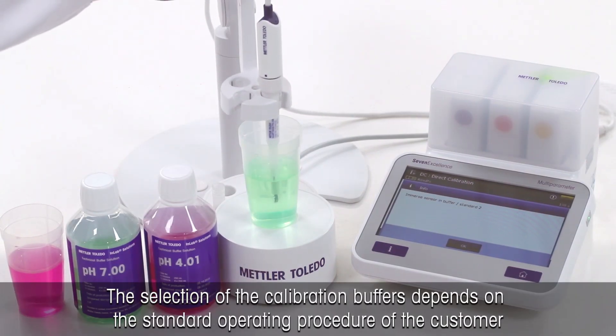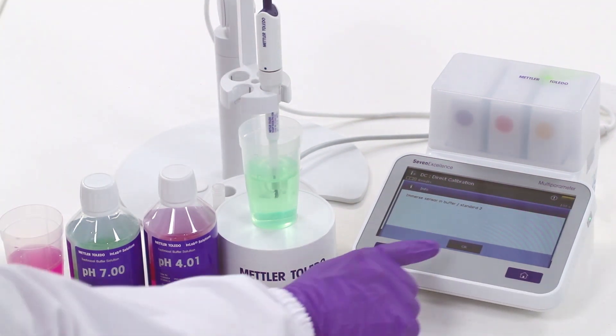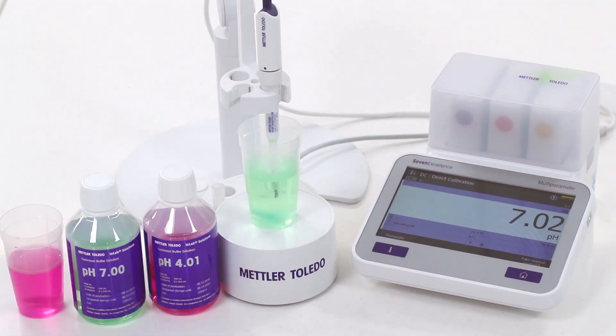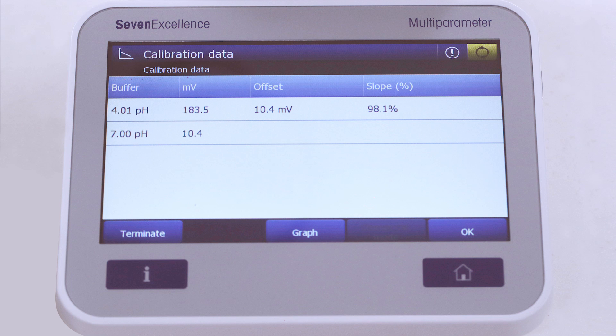Use an electrode calibrated with pH buffer solutions from Mettler Toledo. For example, if you would expect a pH value of 5.00, use the buffers pH 4.01 and 7.00 in order to bracket the expected measurement value.